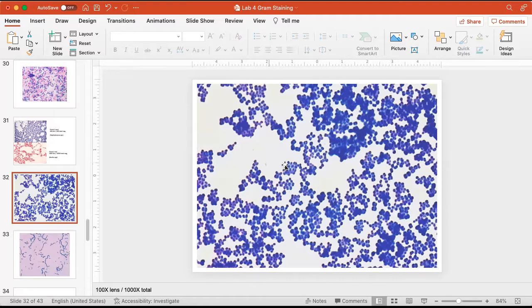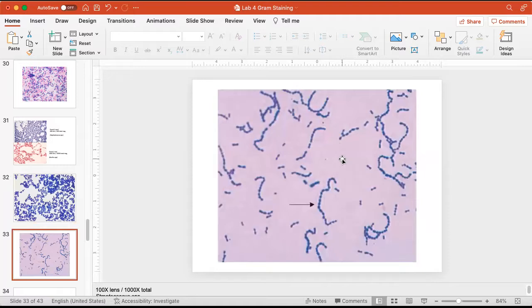It's going to be just nice and clear and white. But when you take body fluid and you make a smear from it, the background is going to pick up some color. So the material from the back of this person's throat had also picked up some stain color, mucus, and so on. But here's my organism, right?